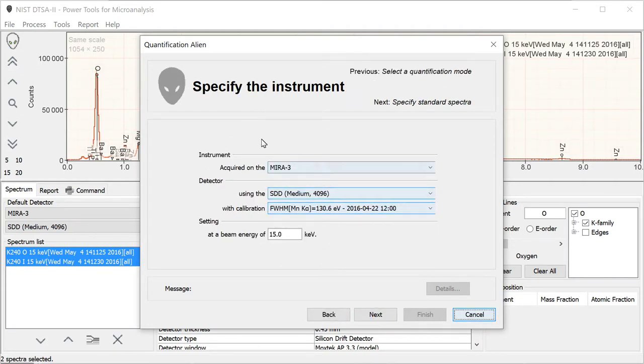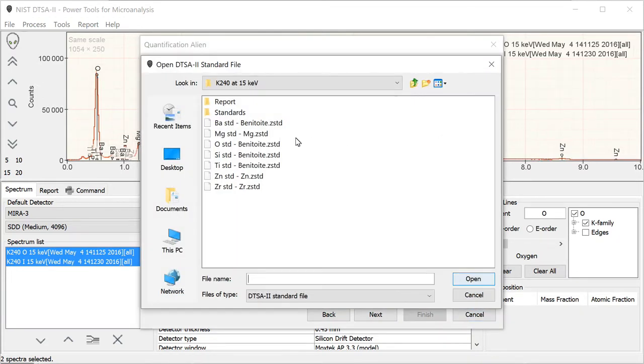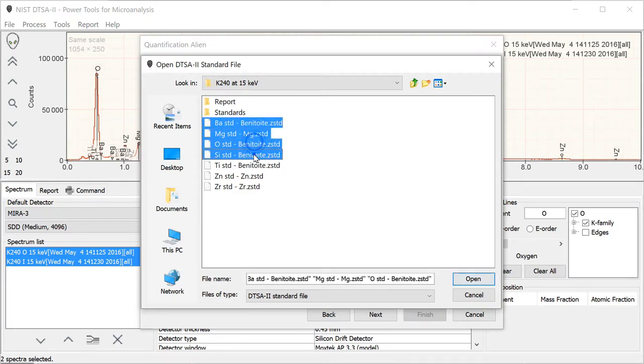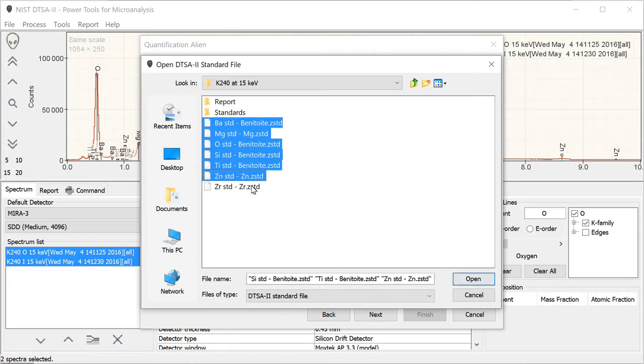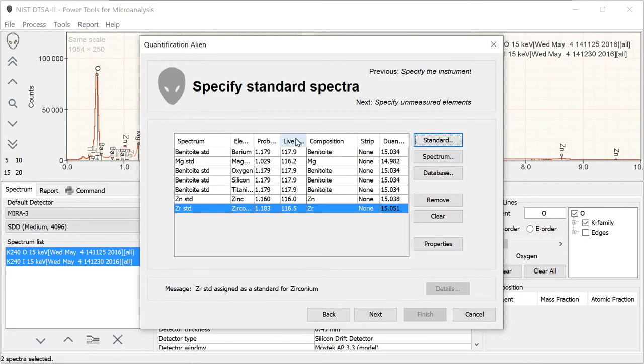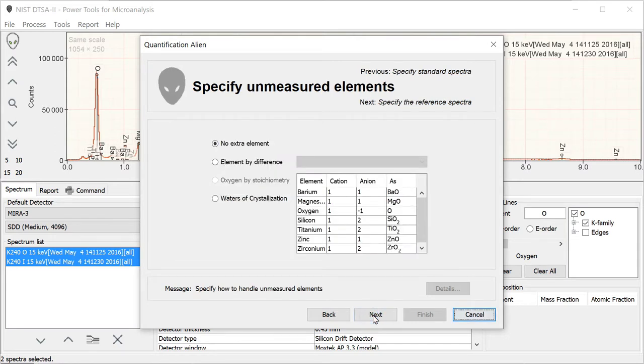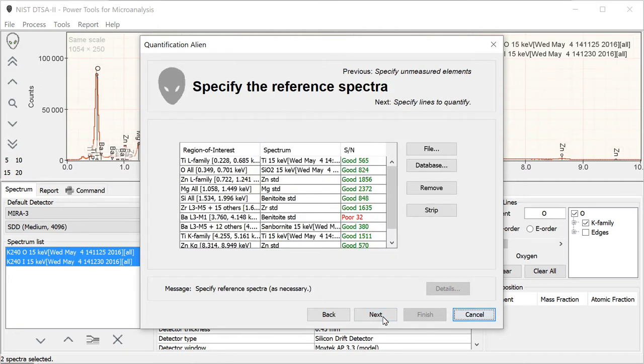This data should all be correct. Now we're going to select the standards that we just created. For barium, we're going to use the Benitoite standard, magnesium, essentially all these standard files. We're just going to open them up. They're read in. All the information should now be correct in here. It should specify the element it's being used for, probe current, live time, and the composition of the standard. This is all correct now. Because we've provided an oxygen standard, there is no extra element we need to worry about. We're not doing oxygen by stoichiometry. We're actually measuring it.